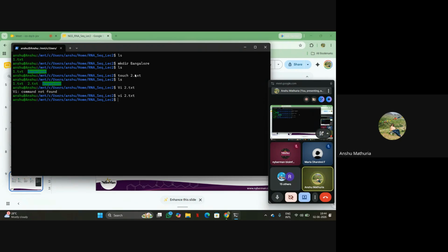So how am I going to show that? We have a file, you can see 1.txt and 2.txt. Either we can go into our subsystem, open the file and see that, okay, hello is written, or otherwise we can display it onto this terminal as well. The command to display whatever is present in your file is cat followed by the name of your file, 2.txt. You can see hello is printed here. This hello is the content that is present in 2.txt.